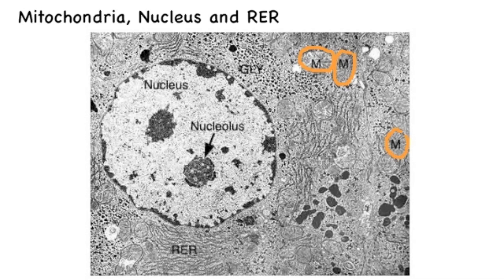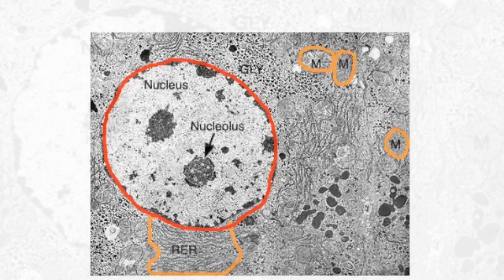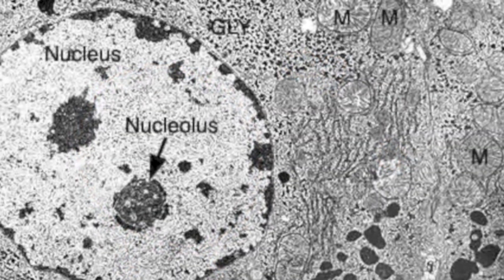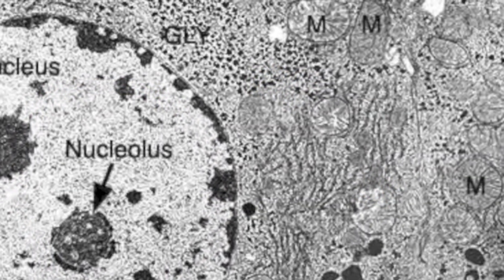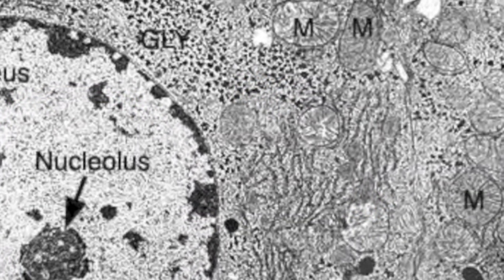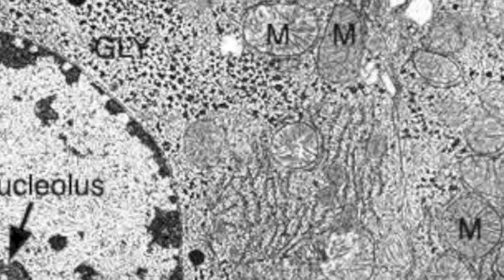Here I'm distinguishing between the mitochondria, which I'm circling in orange labelled with an M, the rough endoplasmic reticulum RER also in orange, and I'm circling around the nucleus in red. Zooming in, it is once again possible to identify the mitochondria by the lines on the inside formed by the inner membrane.